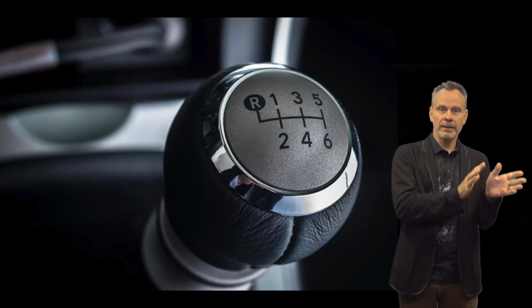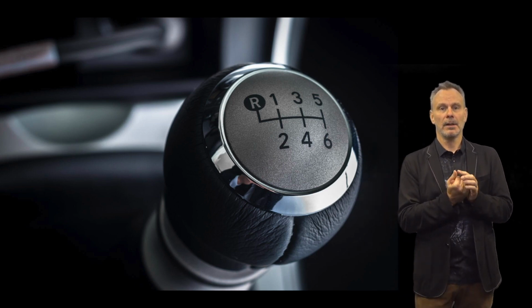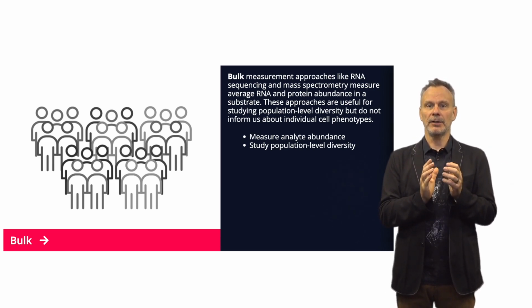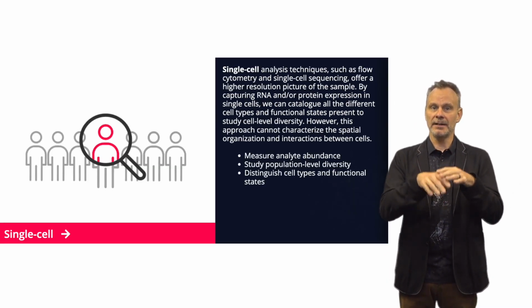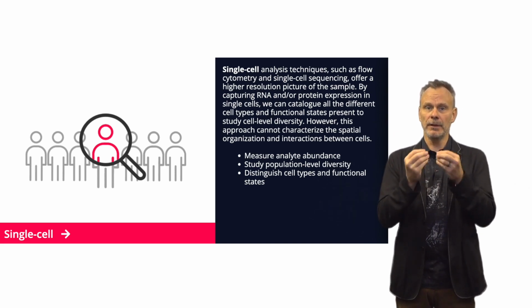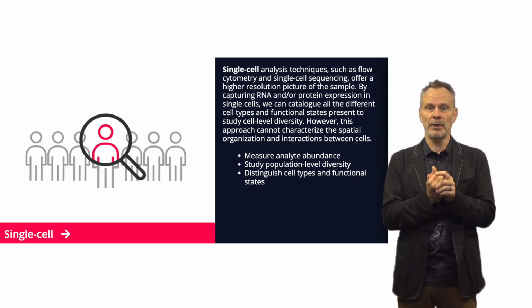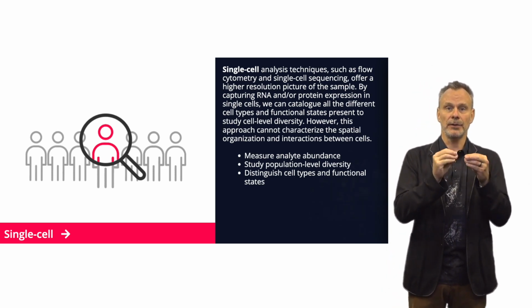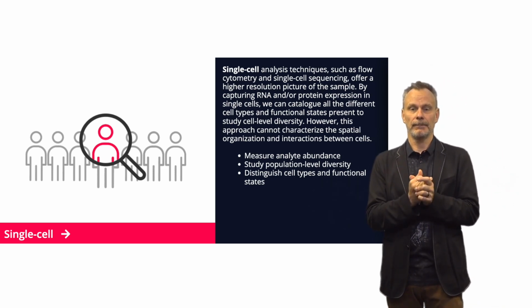Let's switch gears from the methods to the actual samples used in these methods. Single-cell analysis is a cutting-edge technique in the field of biology and medicine that aims to study individual cells in isolation, rather than analyzing bulk samples which provide an average response of many cells. Since individual cells within seemingly identical populations can show significant variations in terms of gene expression, protein levels, and subsequent metabolic activity, analyzing cells on a single-cell level can provide insights that are masked in conventional bulk analysis.